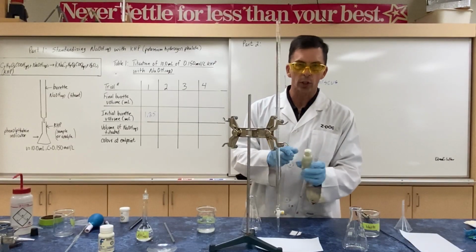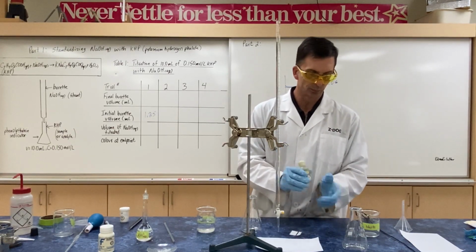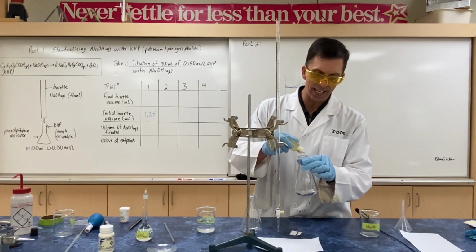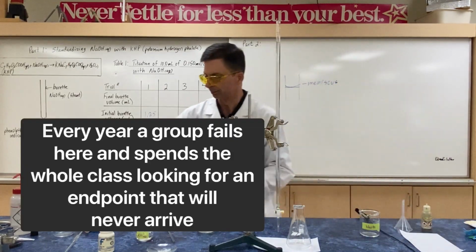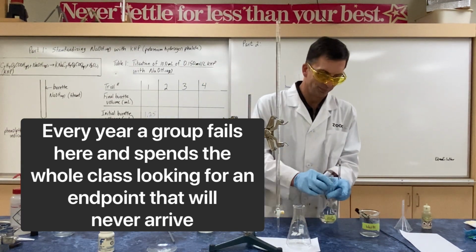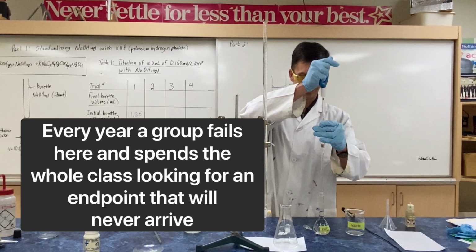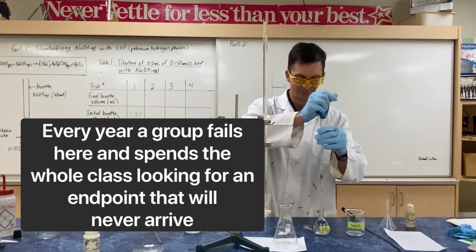Acid-base reaction, we're going to use phenolphthalein as our acid-base indicator. What happens if we forget to put this in? We don't put the indicator in, we're not going to get a color change and be able to note our endpoint to the reaction. So you have kids that use an entire burette of chemical waiting for the endpoint. And then they're like, when does it end? And I go over there and talk to them. And I put 1 drop of indicator in and it turns so pink my eyes bleed.